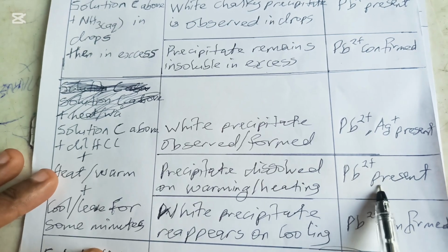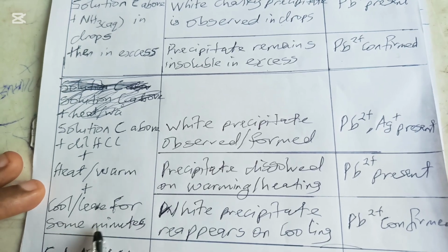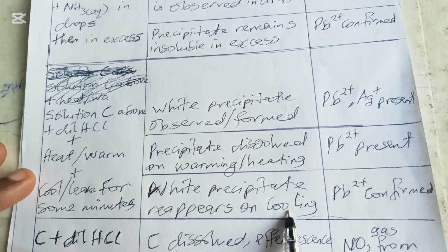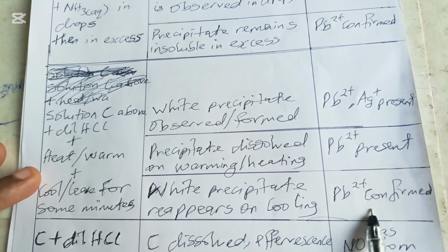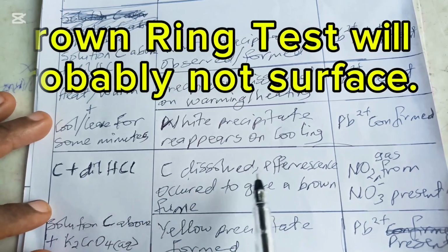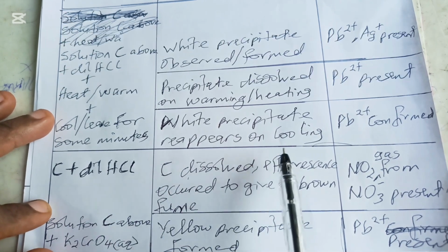Pb2+ is present. We are trying to confirm it here in another method now. They now say you should cool or leave for some minutes. They can say you should leave for 5 minutes or something like that. Their aim is for you to cool it. White precipitate reappears on cooling. That's another way to confirm this, please. Now, they might tell us to do a brown ring test, but because of the reagents we are to prepare, iron(II) sulfate, freshly prepared, is not part of it.